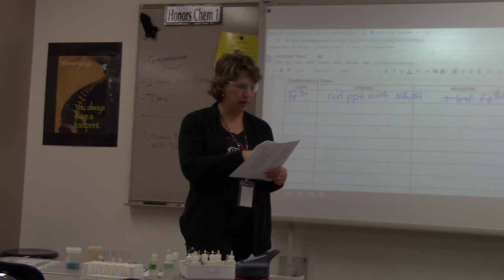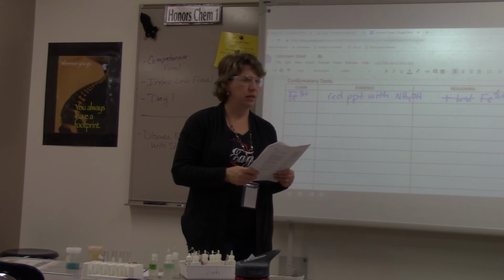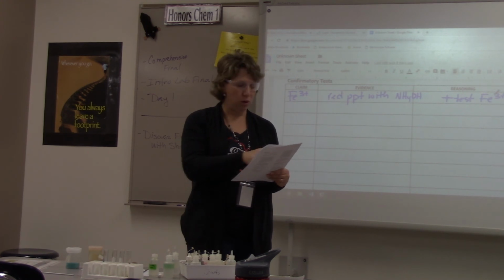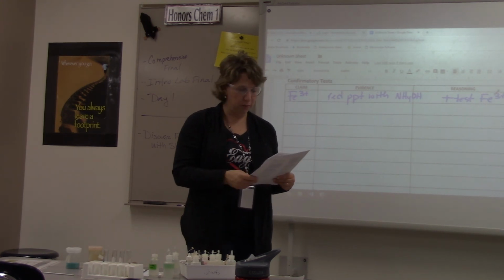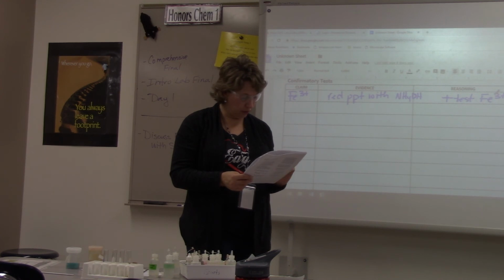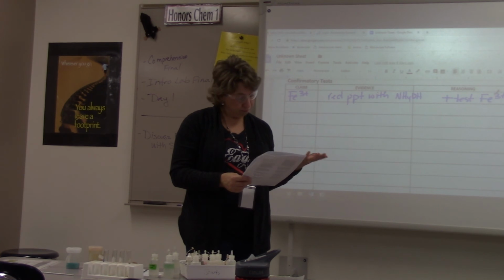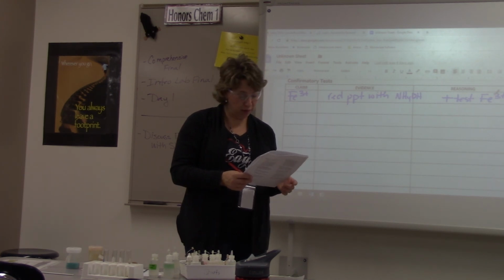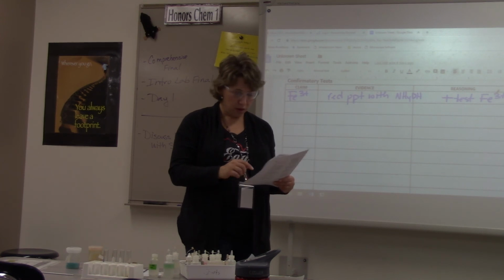I don't know quite what that is, but did we have a reaction with dilute sulfuric acid? Did ours react with H2SO4? No. So probably not acetate. Let's look and see if something else matches better. Chloride down here. Oh, it says it does not change the pH of it, but dilute sulfuric acid does not usually react with chlorides. I don't know if there's anything that totally disqualifies that, but we'll have to look and see.